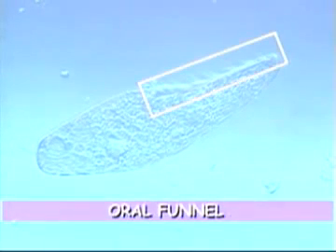Another common protozoan you find in pond water is Blepharisma. Like paramecia, it swims along feeding mostly on bacteria. Blepharisma has a large oral funnel or mouth, lined with long cilia which it uses to direct food into the funnel. As with paramecia and many other protozoa, Blepharisma reproduces itself through fission.